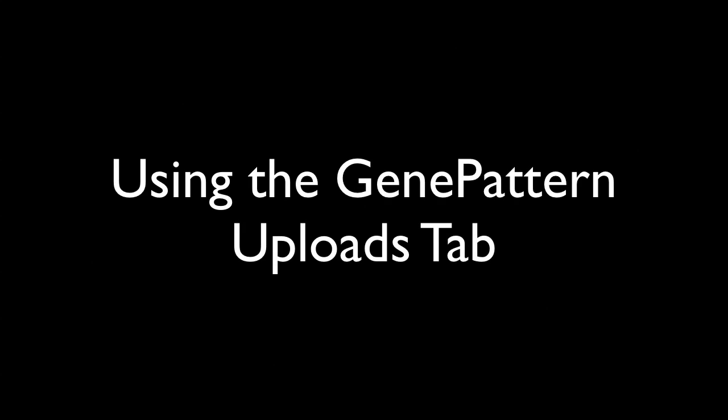In this tutorial, we will go over the basics of using the GenePattern Uploads tab and the ways it can help to facilitate the use of data, large and small, in GenePattern. GenePattern 3.3.2 introduced the Uploads tab, which allowed users to upload data files over 2 GB to a GenePattern server.